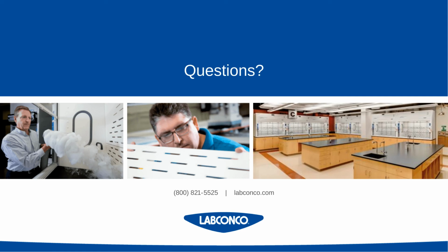However, it's really an application by application basis. You really need to evaluate what you're doing inside the hood and determine if your application allows for the reduction of face velocity based on what you're doing, how you're doing it, whatever your process is, SOPs of your building, various things like that. Sometimes those types of answers already exist within a lab's chemical hygiene plan.